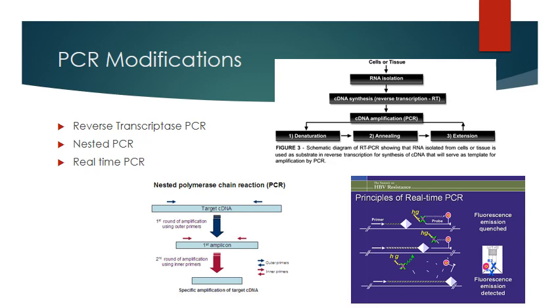Like in conventional PCR. In conventional PCR, we just want to know, is it there or is it not? In real-time PCR, we can actually watch that exponential increase of the target, which allows us to do the math and produce either quantitative or semi-quantitative results so that we know how much of the target was in the original specimen. That's the idea.